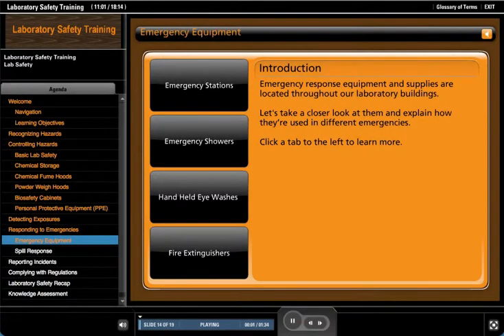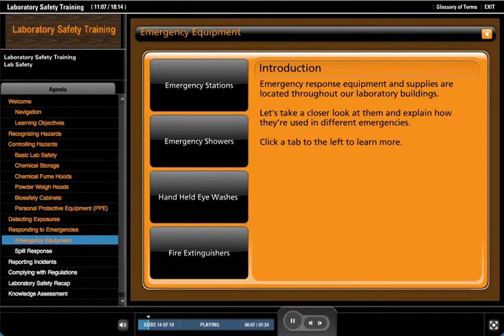Emergency response equipment and supplies are located throughout our laboratory buildings. Let's take a closer look at them and explain how they're used in different emergencies.